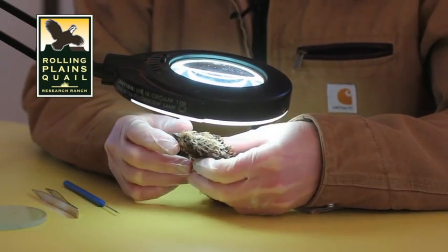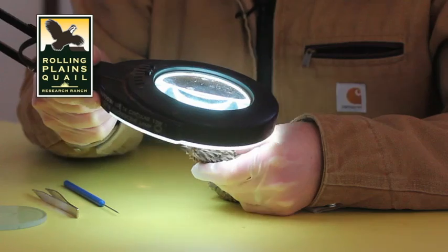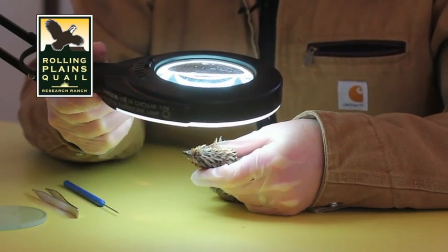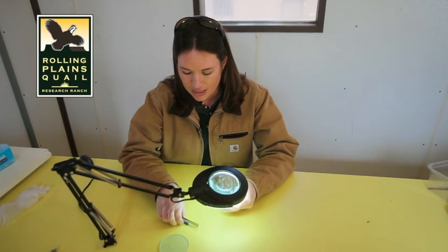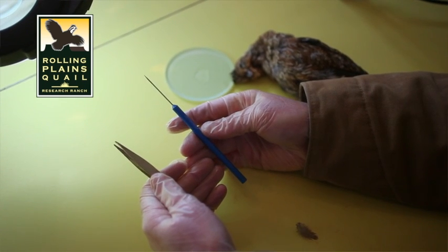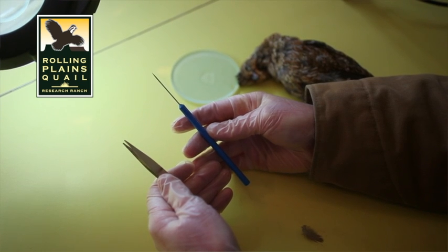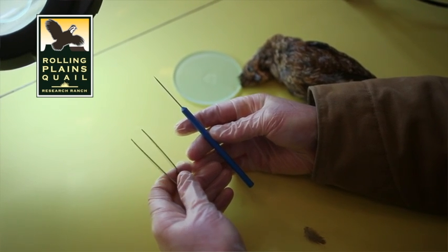I have a bird here that's been hunter shot, and looking for eye worms in birds that you shoot is really quite simple. You don't need any special equipment. I have here a dissecting probe, but you could use a needle or even a paper clip, and a simple pair of tweezers.